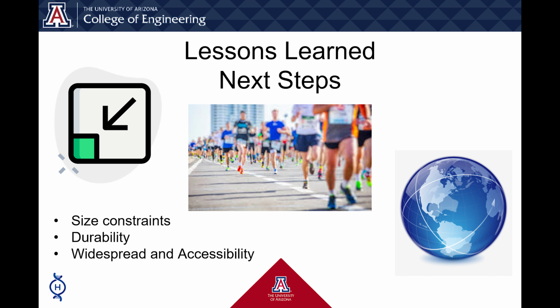Longevity is also crucial. We've learned the significance of using high-quality materials to prevent wear and tear. Investing in durability not only enhances the module's lifespan, but also ensures consistent performance over time. Moving forward, we recommend Roche continues to focus on these areas.